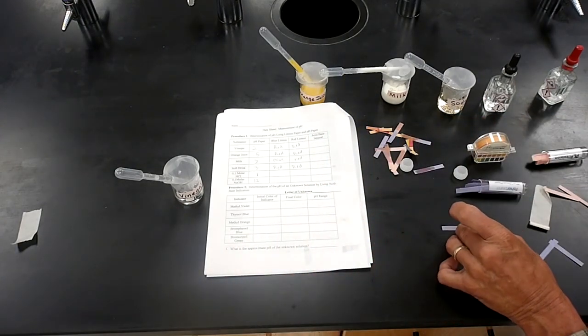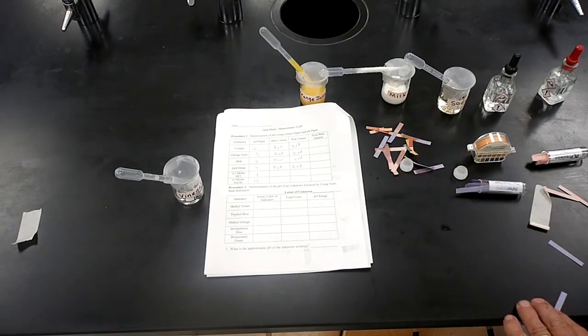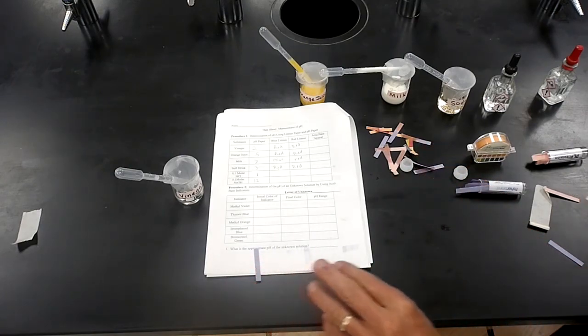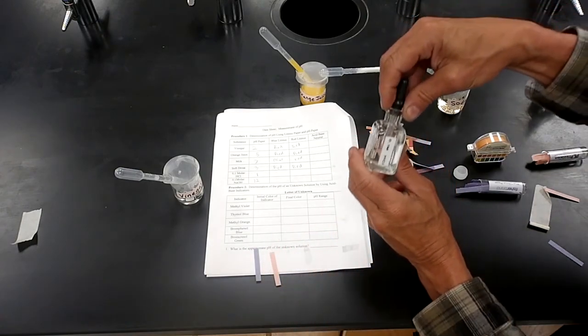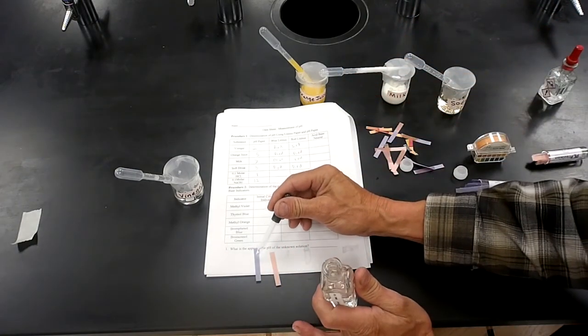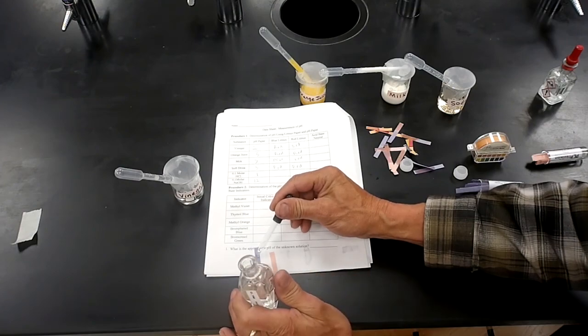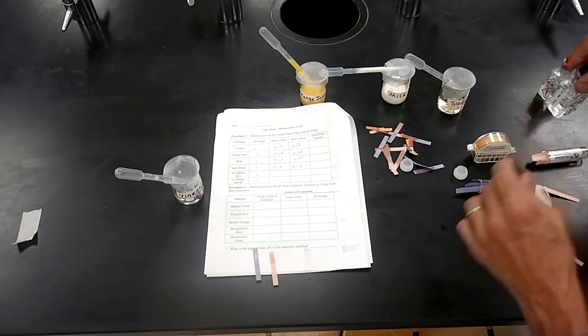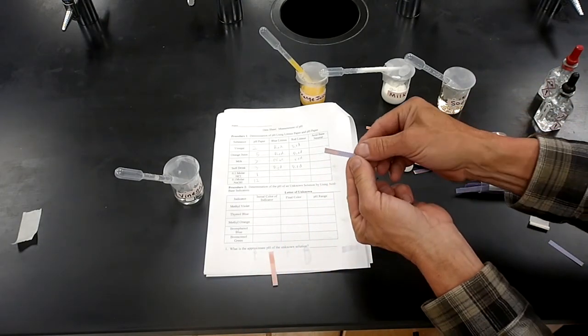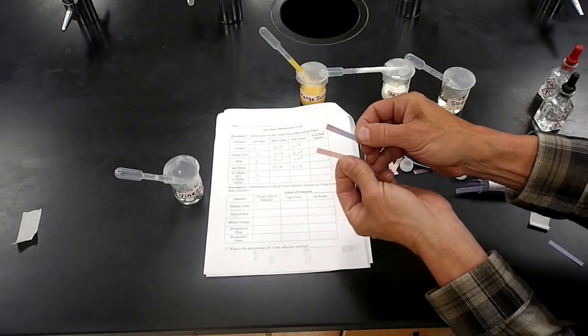And now we'll have the 0.1 molar hydrochloric acid on the blue, on the red, and they are definitely red for sure. On the blue, red; on the red, red.